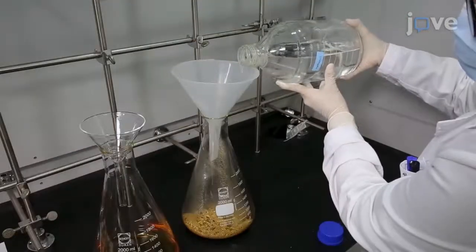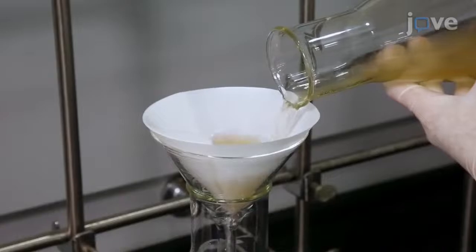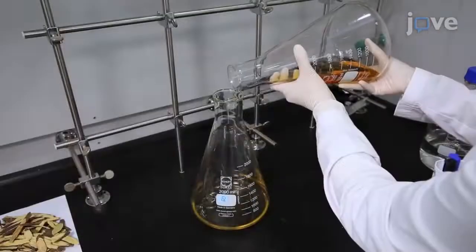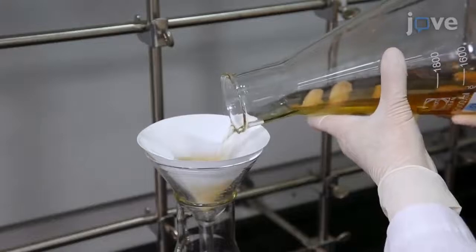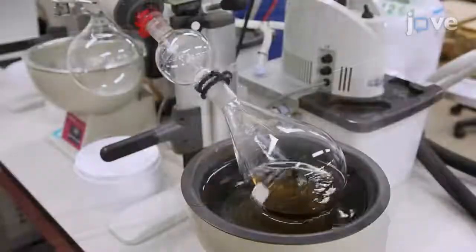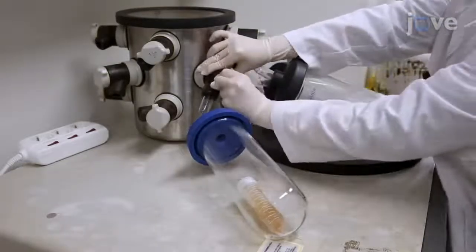Add the GR residue to 1 liter of fresh methanol and filter the solution again. Combine the two filtrates and strain them through a new piece of filter paper. Then concentrate the extract under vacuum before freeze drying to produce GREX.